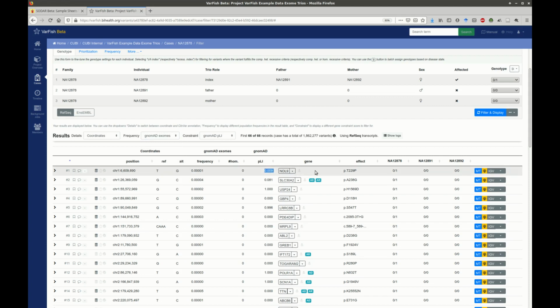The next column shows the gene name with a drop-down of links to other databases, and annotation whether the gene is in the ACMG incidental finding gene list, and HPO annotation of mode of inheritance. The next columns show the predicted variant effect and the genotypes in the samples. The last column contains buttons with link outs to MutationTaster, the Global Alliance Beacon Network for this variant, and a button to open the variant locus in IGV, and again various link outs to other databases.